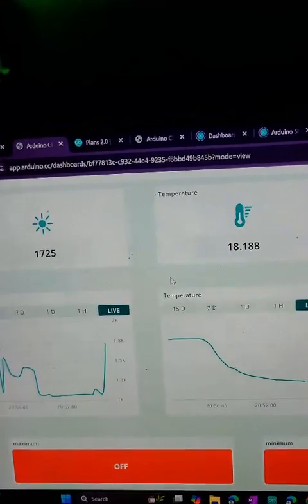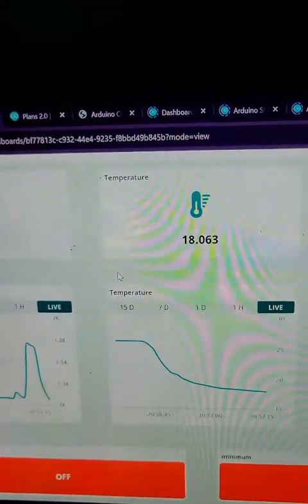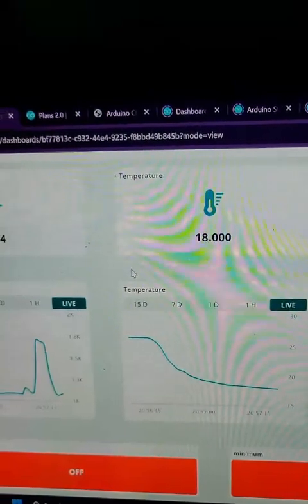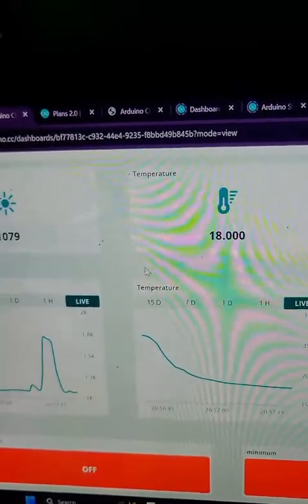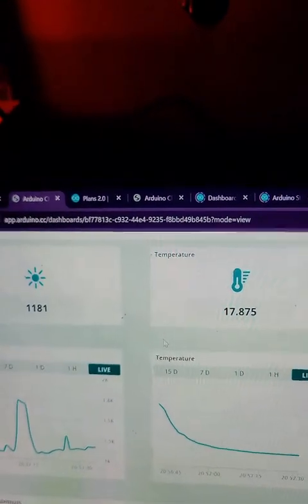Now we're getting closer to our value of 18 degrees Celsius. It should become red now, if it goes below that. See, the system now gives out a red light to indicate that we are using a heating pad. But because I don't have a heating pad, I'm simulating that with colors.